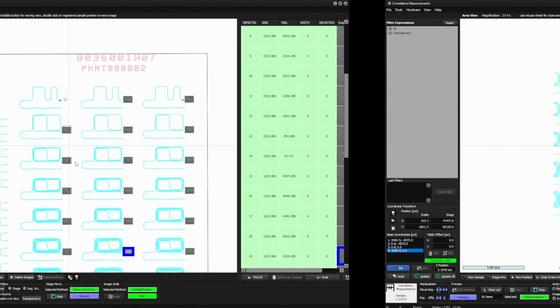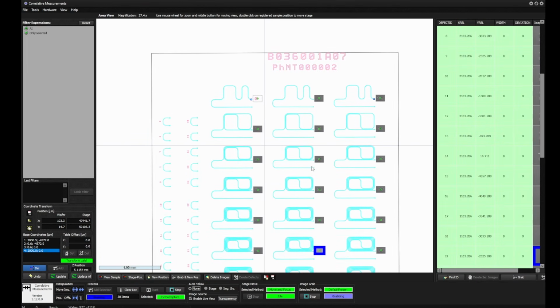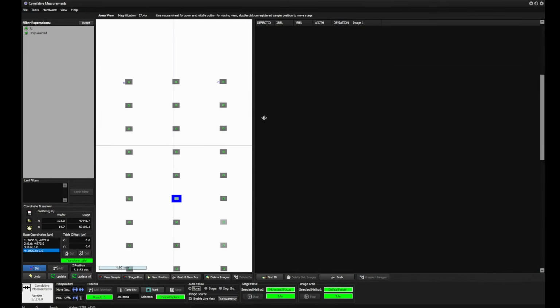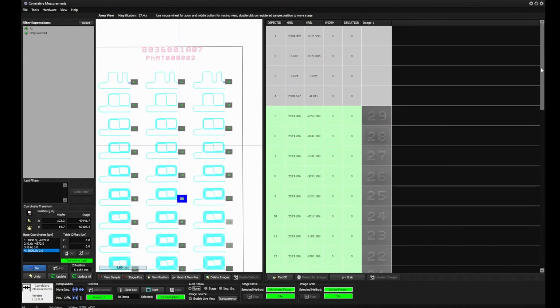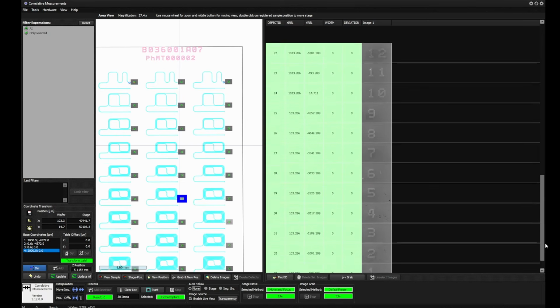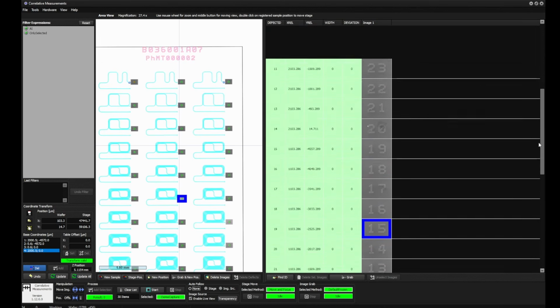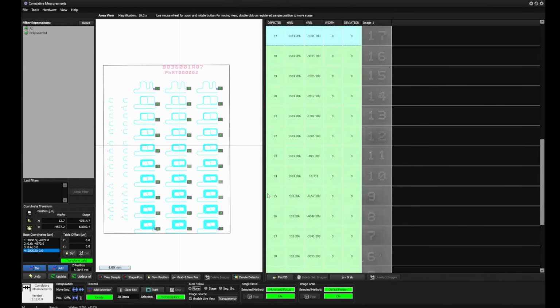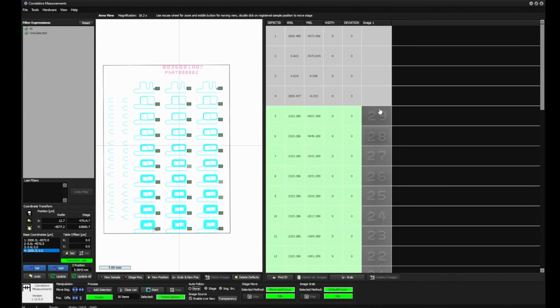And now it's nearly finished. You can see we are on the last. And if we go here, you can see we have a nice list of images of all the numbers, and they are more or less at the right position. This worked quite nicely because the magnification we use here is just below 1000 times.